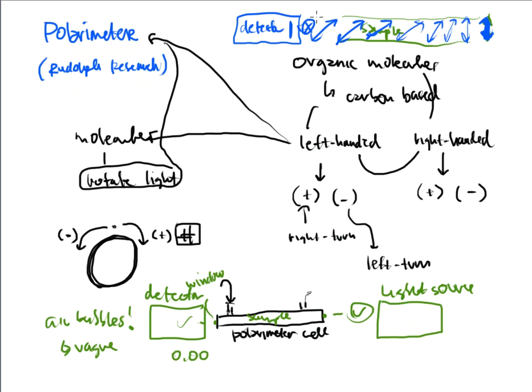So the detector makes the decision. Okay, it's not coming through the way I'm oriented right now, so I'm going to slowly turn myself, either left-handed or right-handed, in order to get the light to come through. And this detector will rotate. It will twist, it will turn until it sees the light. And just like in Poltergeist, when it sees the light, it will stop and everything is good in the world. Come to the light.